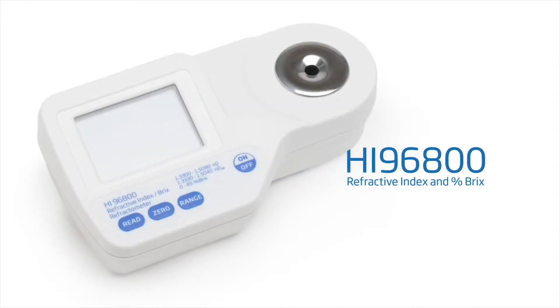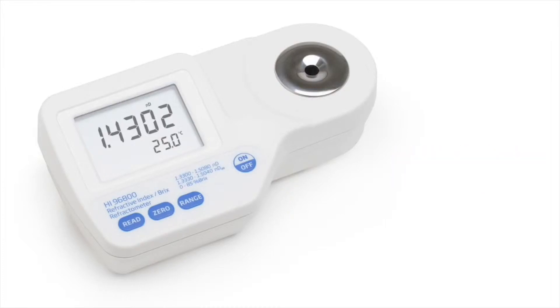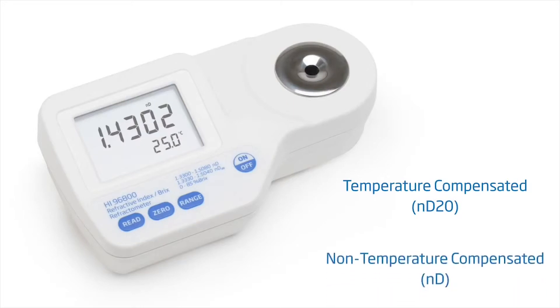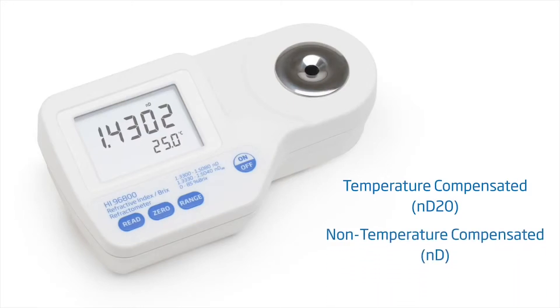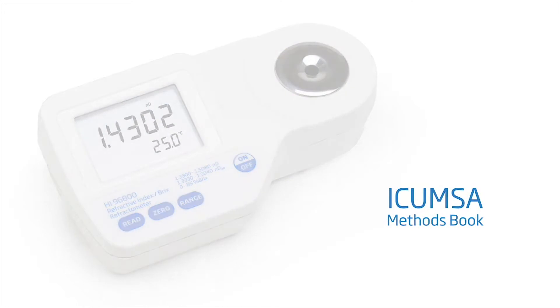The HI-96800 is a digital refractometer for the measurement of refractive index and percent Brix in aqueous solutions. The refractive index of a sample can be displayed in both temperature-compensated or non-temperature-compensated formats. The temperature-compensated readings are based on temperature algorithms in accordance with the ICU-MSA methods book for a percent-by-weight sucrose solution at 20 degrees Celsius.